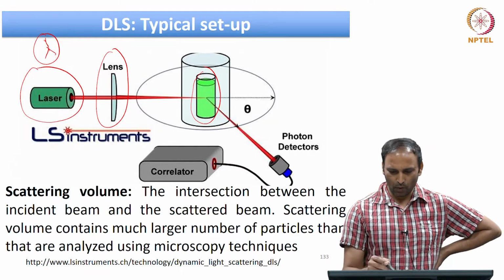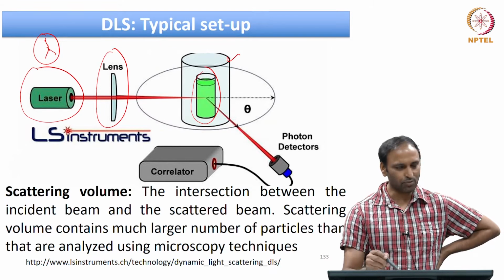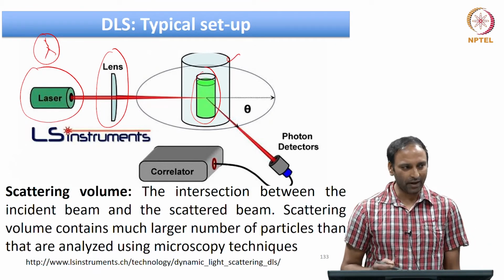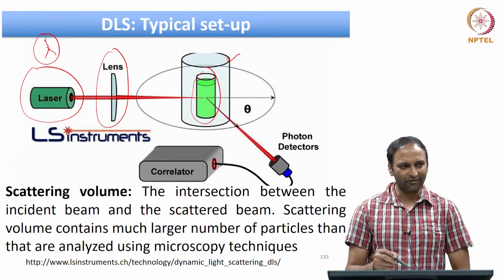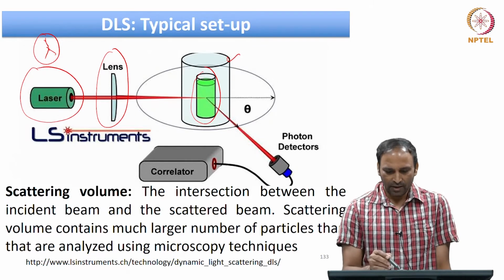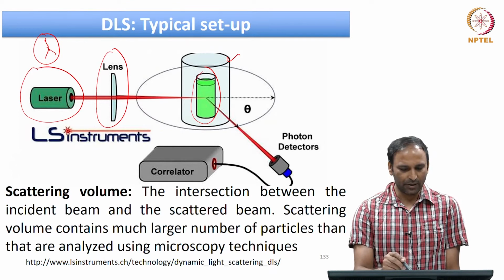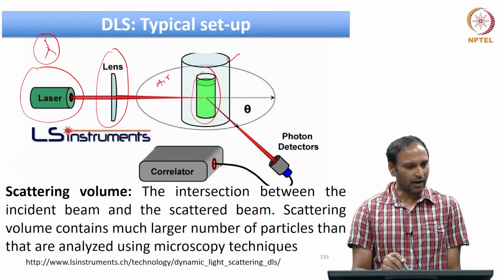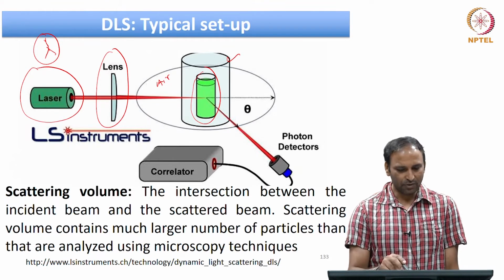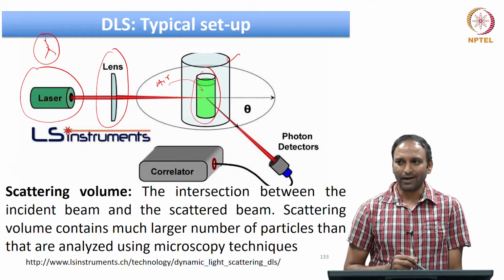Okay, so what is shown here are two beakers, right? There is one beaker here and there is a small beaker there. Not every instrument will have this kind of a setup. The reason it is done is that when you have a beam coming in, it is typically coming in air, and then it is going to go into a sample. When that happens, there is going to be a change in the refractive index, right. You do not want any of that happening.